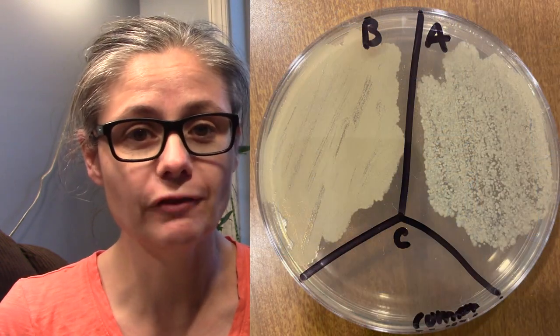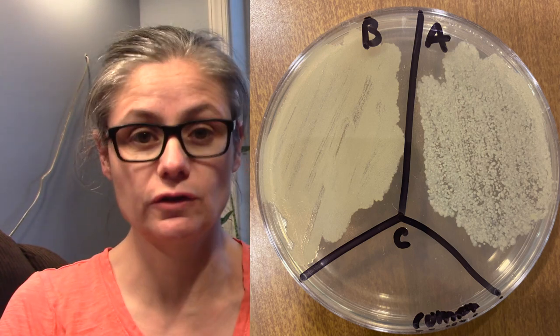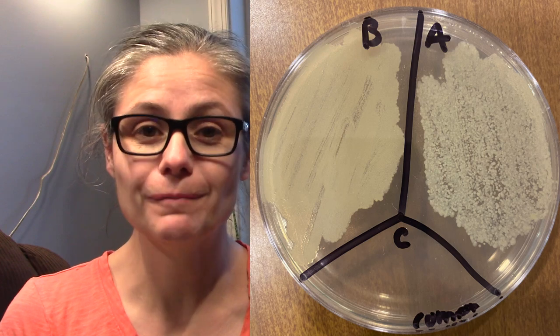Now for some results. Remember, B is before cleaning with Comet and A is after cleaning with Comet. We can see in section B for before there is a tremendous amount of bacteria. And then looking at A for after, we can see a decrease in bacteria, but it is not a significant decrease at all. So in my opinion, the Comet powder does not do a good job at disinfecting my toilet bowl.